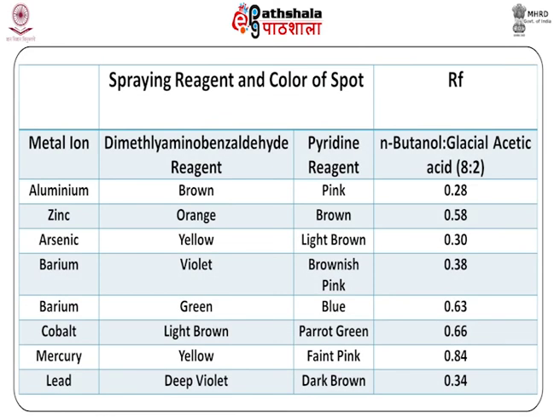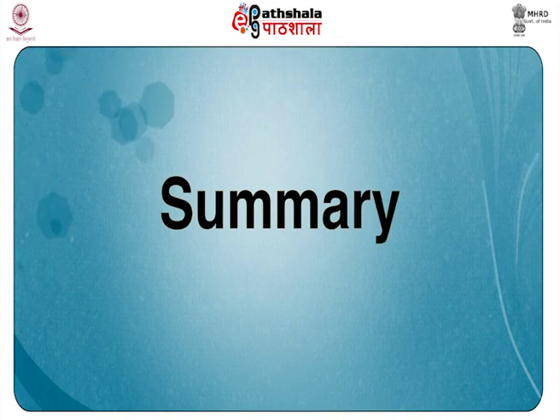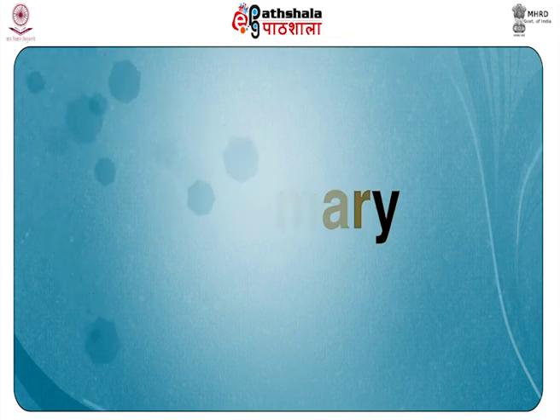methanol. The table shows the response of various cations to the solvent system N-butanol to glacial acetic acid in the ratio of 8:2, after spraying the TLC plate with dimethylaminobenzaldehyde reagent and pyridine reagent. So dear students, let us now summarize what we have learned in this module.